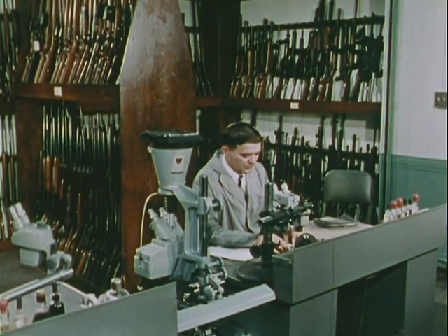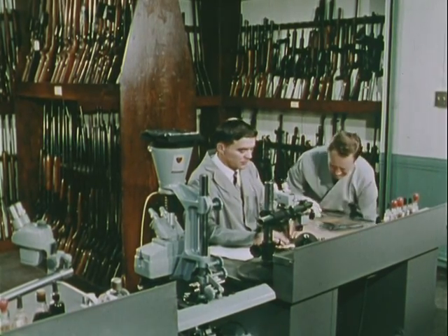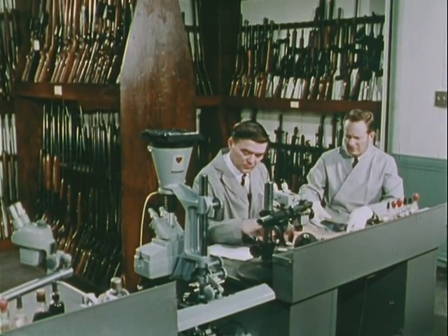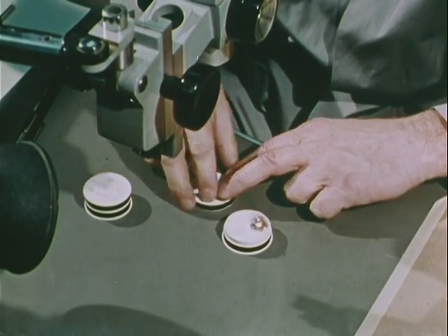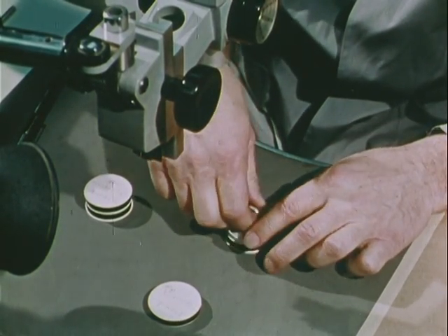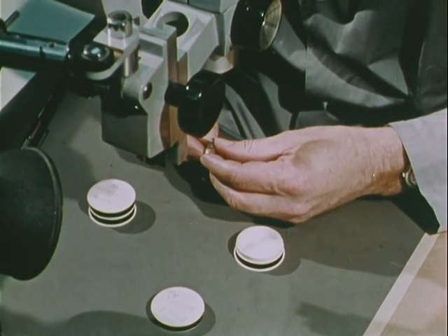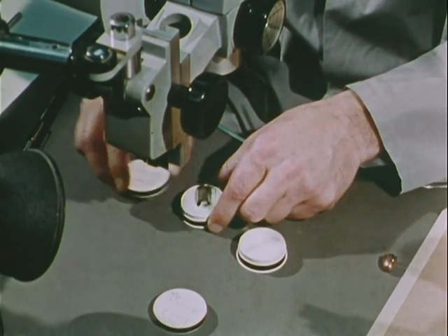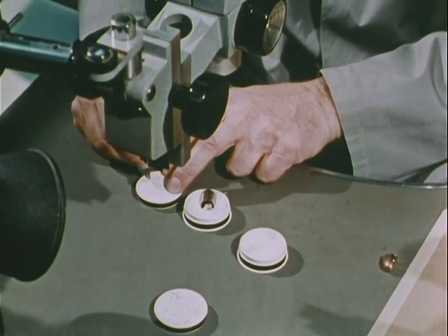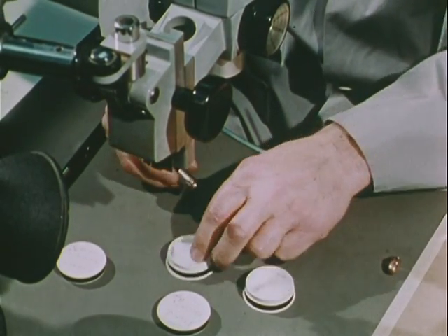The Firearms Identification Unit of the FBI laboratory is primarily concerned with identifying the gun from which a particular bullet was fired. They also examine many other factors involving firearms, tool marks, and explosives in the commission of a crime. In this case, a spent bullet found in the victim, a cartridge case found at the crime scene, and a suspect weapon have all been received from a law enforcement agency for examination by the FBI laboratory.